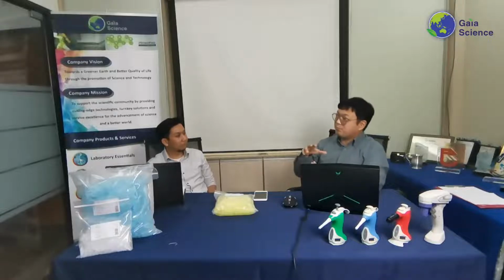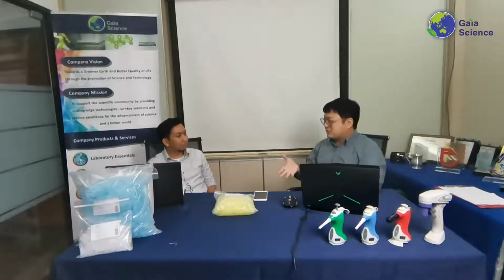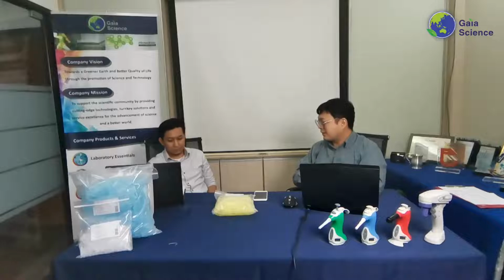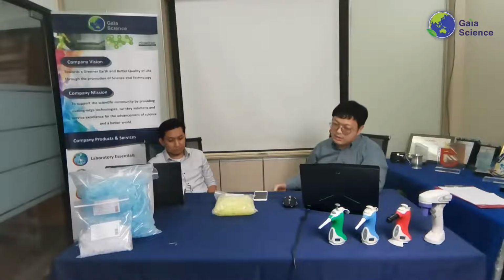But obviously, if you're looking for convenience, rather than buying bulk and then doing it manually, wearing gloves, putting them in every time, autoclaving 10 times, if you get racks, you can just use them on the spot in one go. That's the main difference I would say between bulk and rack tips.